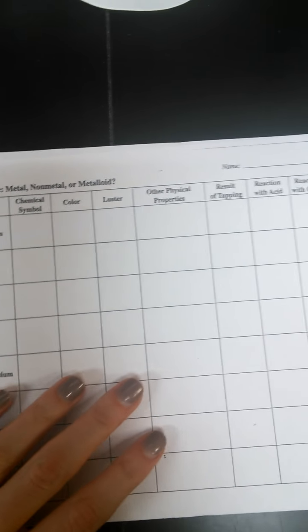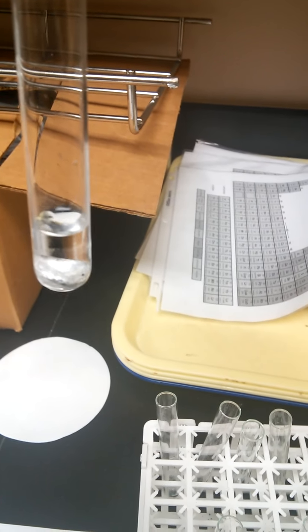And then next we're going to test the reactivity with hydrochloric acid. So I've filled each of these test tubes with hydrochloric acid, and then I'm going to place one of each element in each test tube to see if they react. So that's aluminum. And it doesn't seem to be doing anything. So we'll let it sit. Next we'll put in copper.